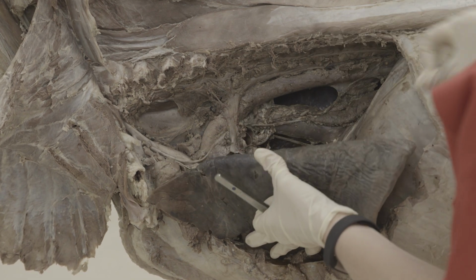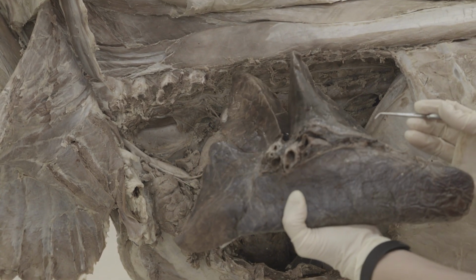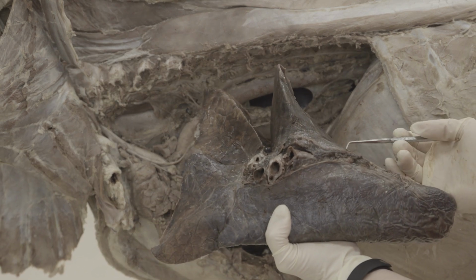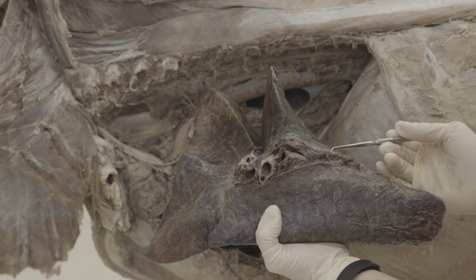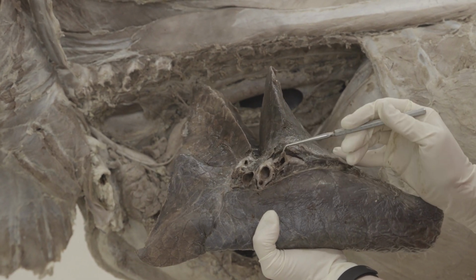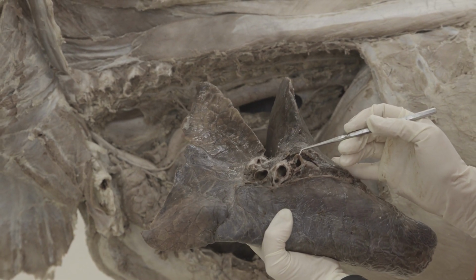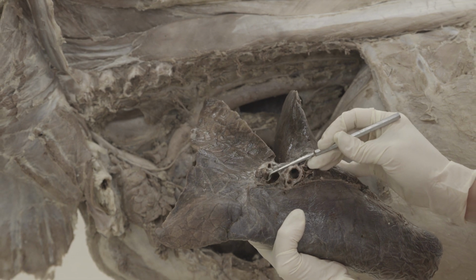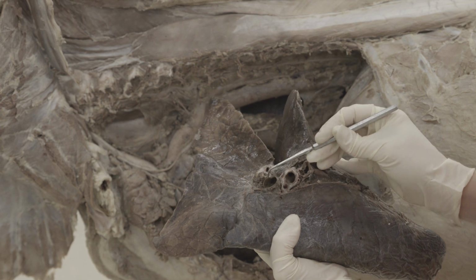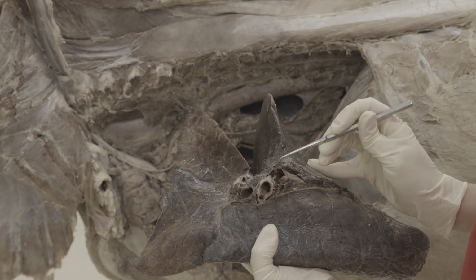So you remove the lung as one whole piece, and then on the calves, of course, we don't have the injection to help us distinguish things. So the bronchi, you have a principal bronchus on the left side that will then go to lobar bronchi, and the bronchi have cartilage in their walls, so those will be easier to identify. Then you'll have pulmonary arteries and pulmonary veins. So pulmonary artery should have a thicker wall. So this one looks like it's going to be a pulmonary artery right here. And then pulmonary veins should have thinner walls. So that might be a pulmonary vein here.